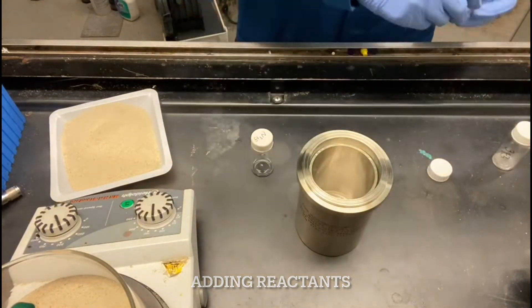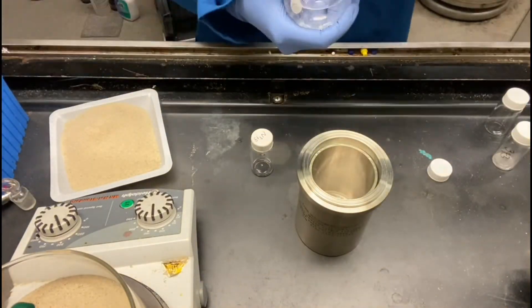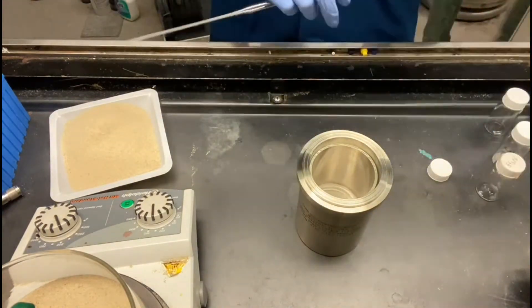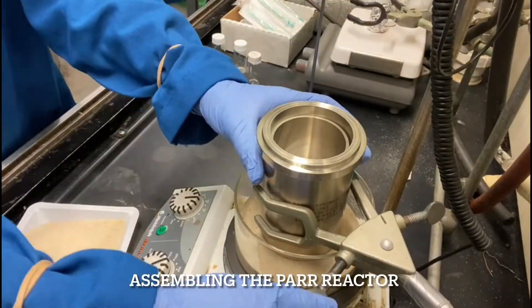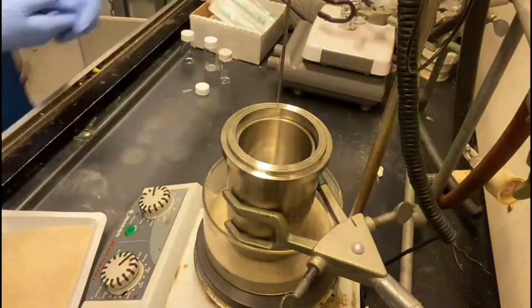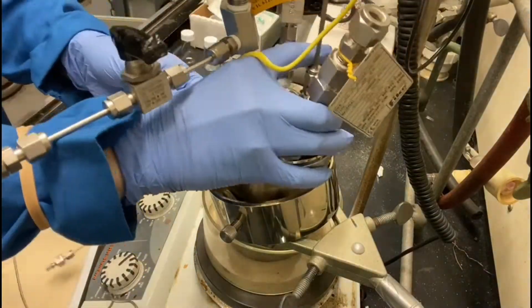To set up the reaction, the reactants are added into the vessel. Then the Paul Reactor is placed in the sand bath for assembly. Here, the reactor is sealed with the gauge attached on top.